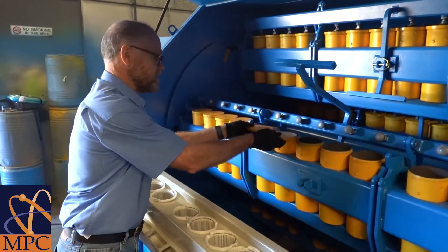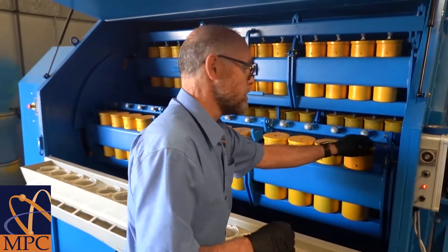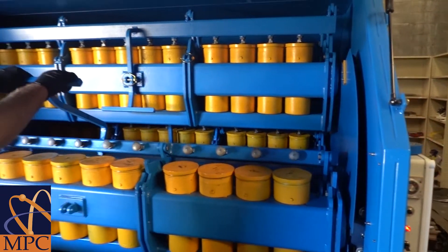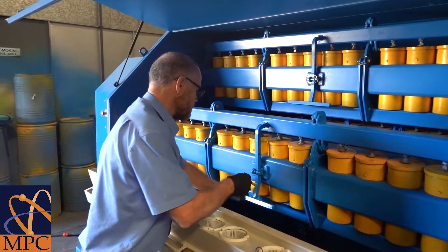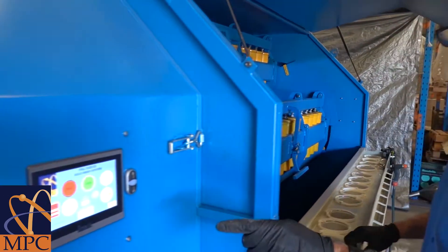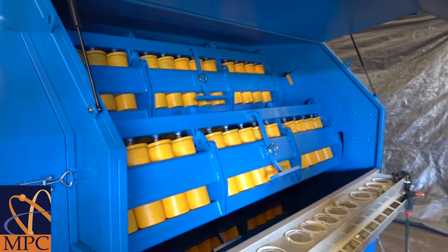We replace the lids onto each of the pots, remove the safety pin, close the arms, and reinsert the safety pin. After we've closed this arm, we move to the screen and press the jog button, which will move the arms around to the next position for loading and unloading.